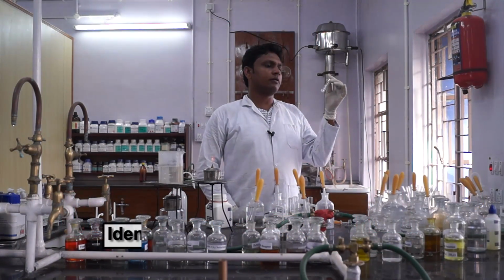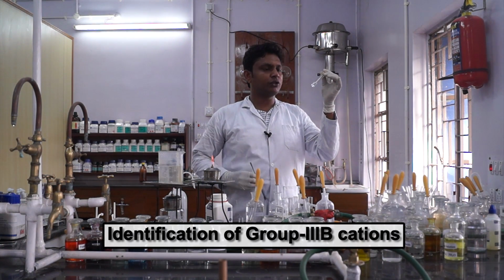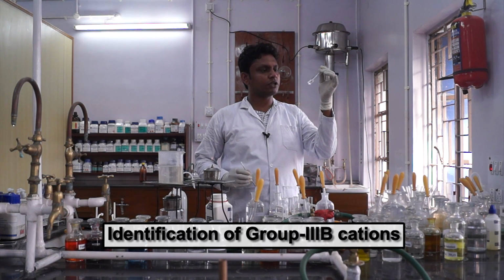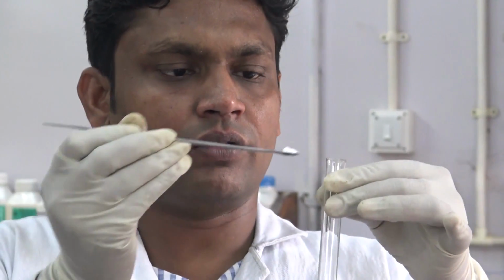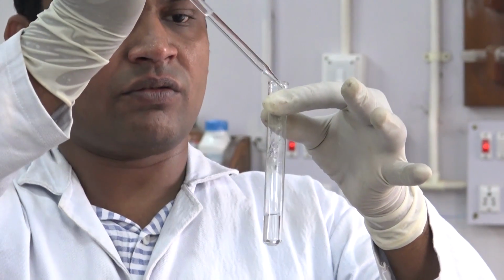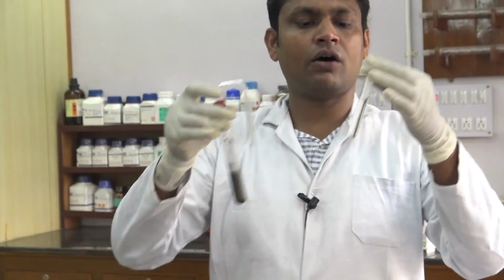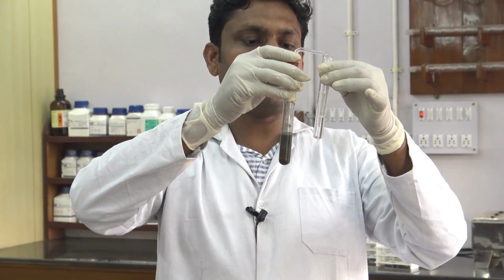Now the treatment of the solution with group 3B reagent. The group 3B reagent is ammonium chloride, ammonium hydroxide and H2S. For this we take a pinch of ammonium chloride into the sample solution, then add a few drops of ammonium hydroxide into it. Here we can see that no precipitation occurs. Now, after adding ammonium hydroxide and ammonium chloride, we pass H2S over the solution.